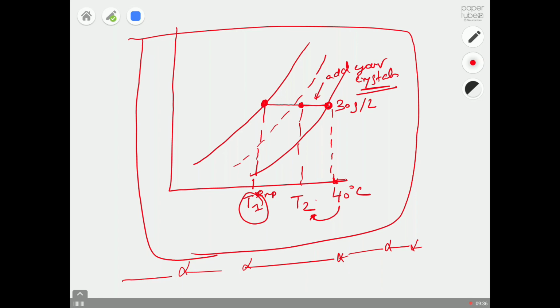At the moment we are not even talking about theory, we are talking about the experimental facts: how we perform the experiments, how the outcomes will look, what we have to understand from the experimental outcomes, and how we exploit them. Solubility is one experimental outcome, metastable zone width is another, and we know how to do that now. We are exploiting that graph to find the perfect process condition where we can avoid or even eliminate the nucleation process.